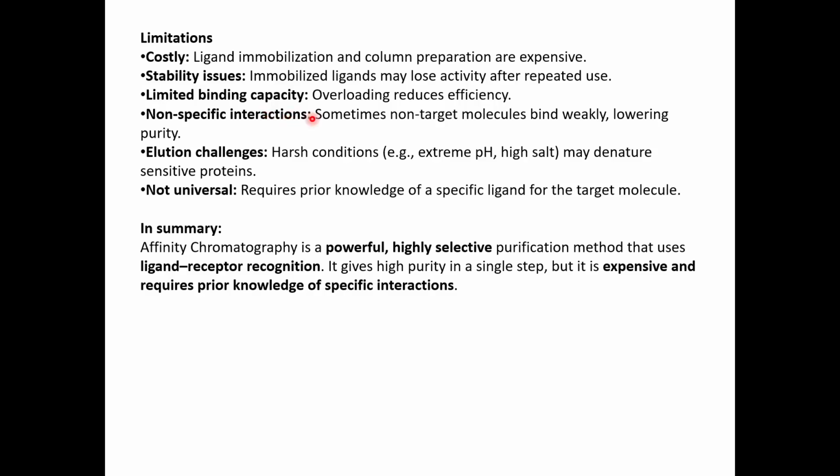Then limited binding capacity. So overloading reduces the efficiency. So when you're continuously using your column, or if there are a lot of different molecules in your mixture or in your sample, and it's too much for the column to handle, then the efficiency might reduce. Then non-specific interactions.